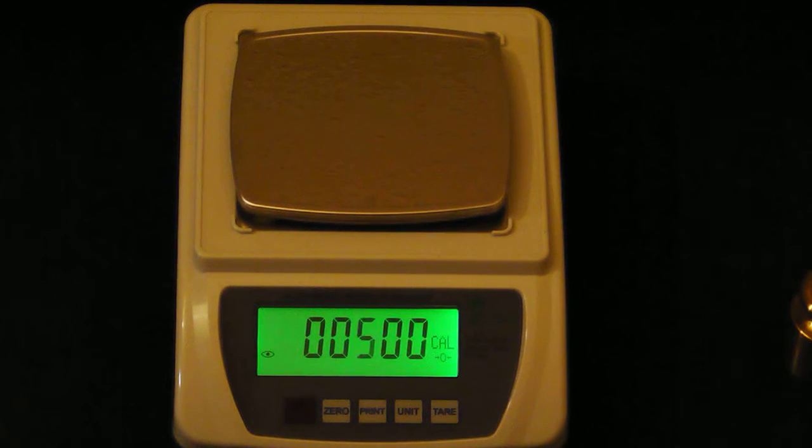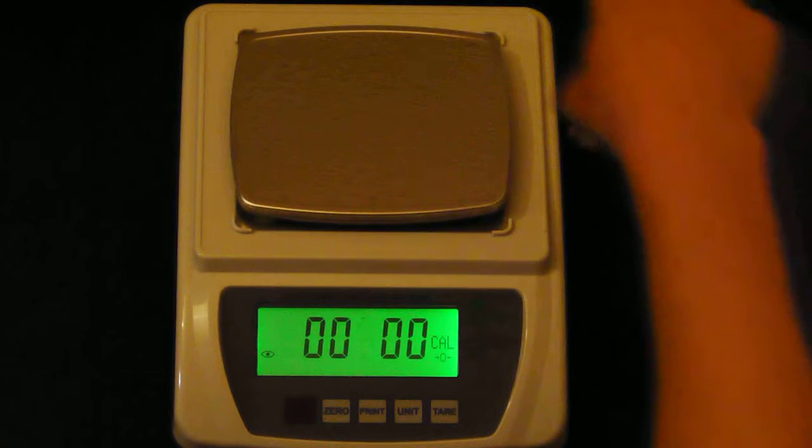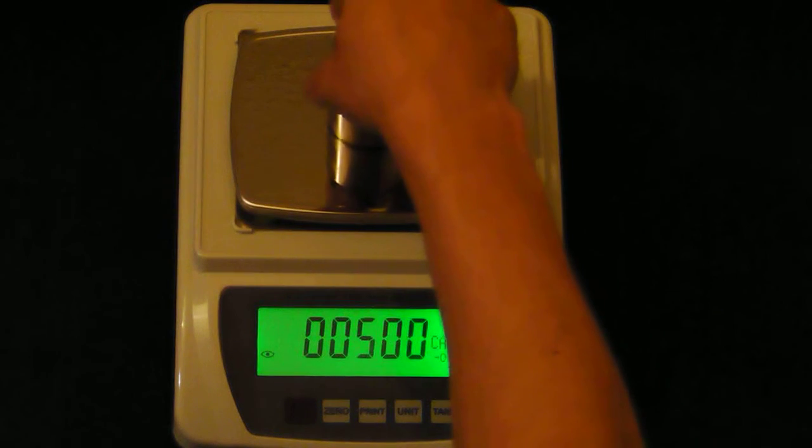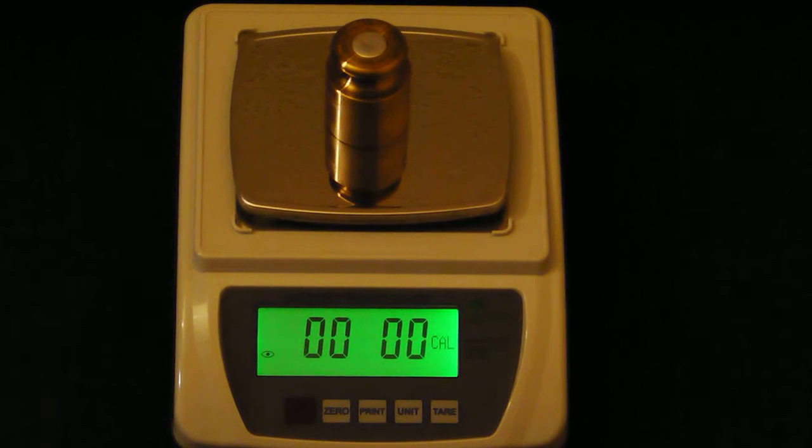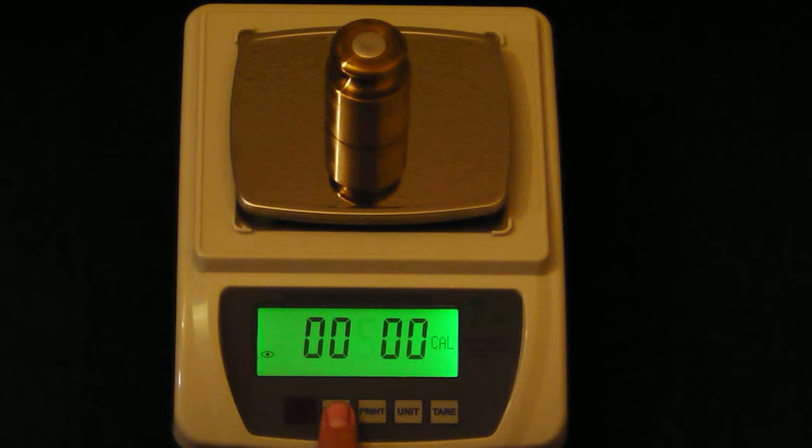Now place your test weight on the platform. We'll be using 500 grams. Now press the 0 key and the unit will display the weight value.